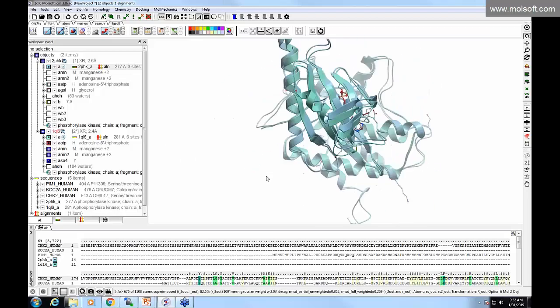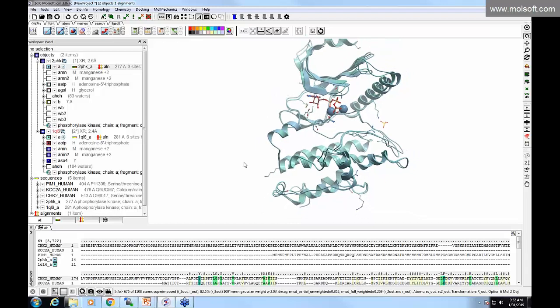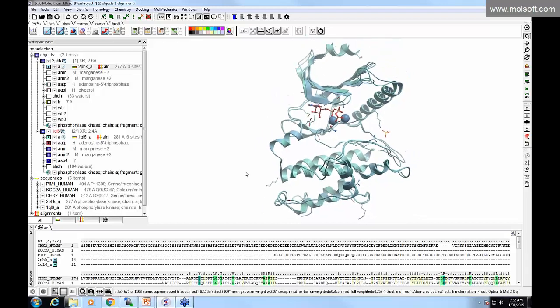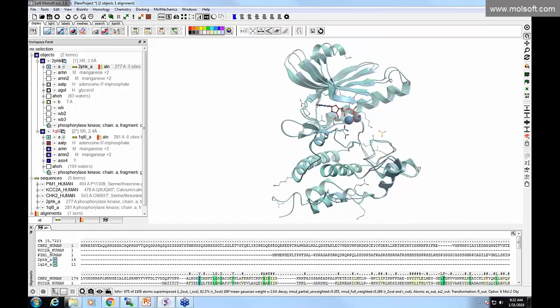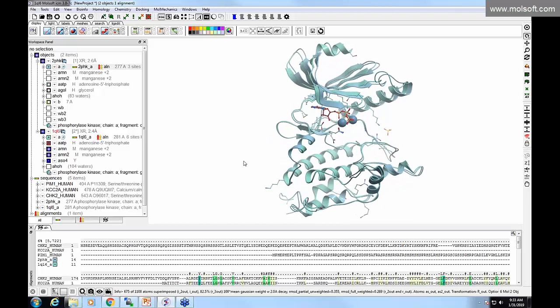Okay. Right. So we need to look at the sequence conservation. So yeah, you can do this. We had a question about other chains. You can use any other chains you want. In this B chain, I think is just a small peptide. It's exactly the same principle. You just need to make sure you extract the sequence and everything.